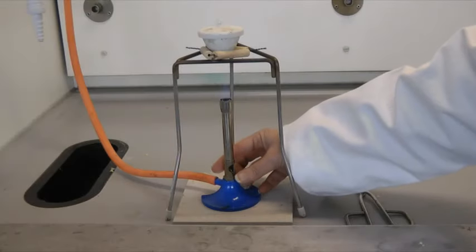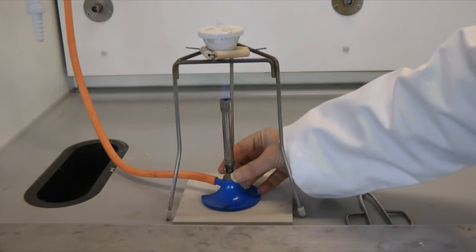The Bunsen should be started on a low flame with the airhole half open. The airhole can then be fully opened very slowly.